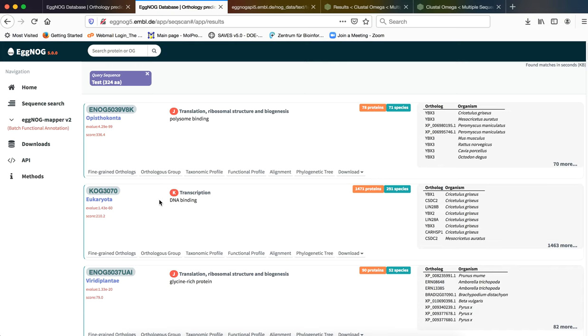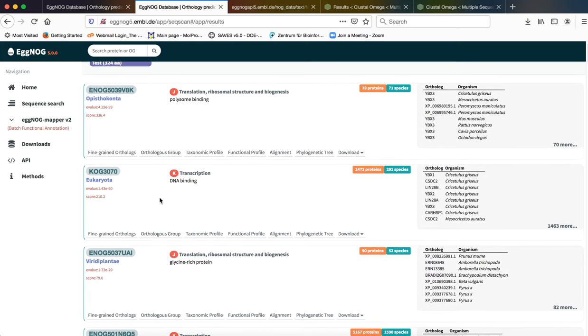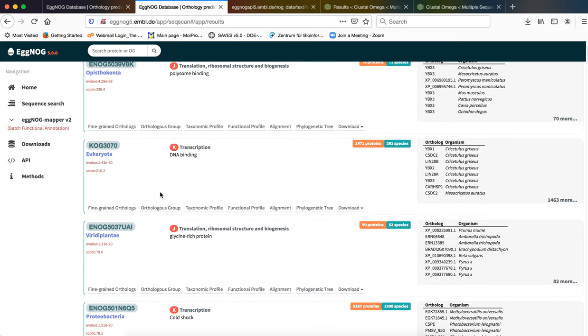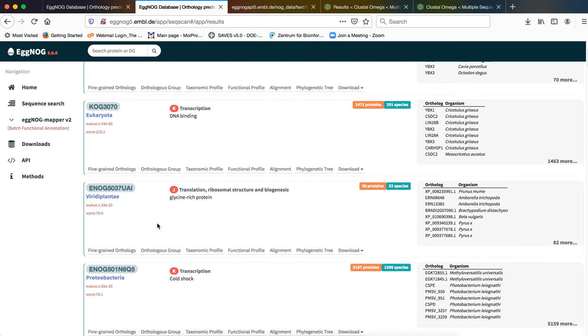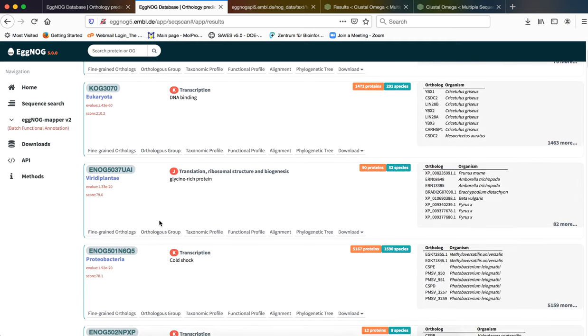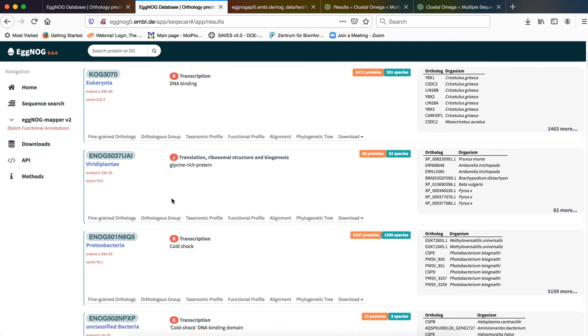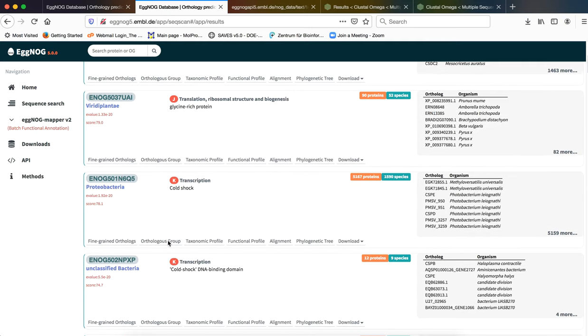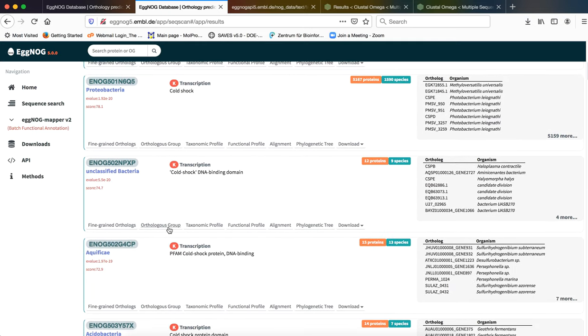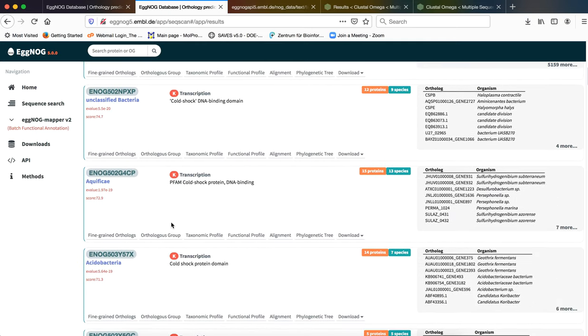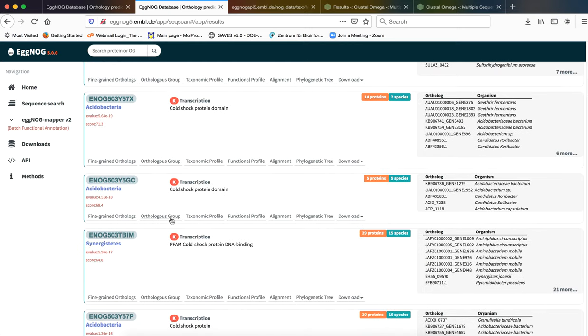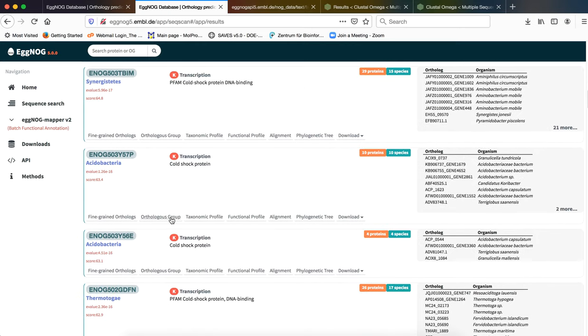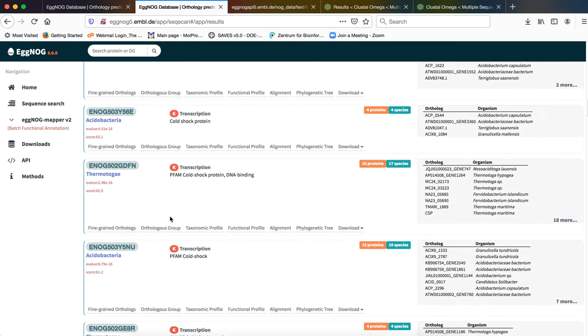If you go down further, you will find there are instances from Eukaryota as a whole, Viridiplantae which is the plant segment, Proteobacteria, unclassified bacteria, actinofeces, acidobacteria, so on and so forth.